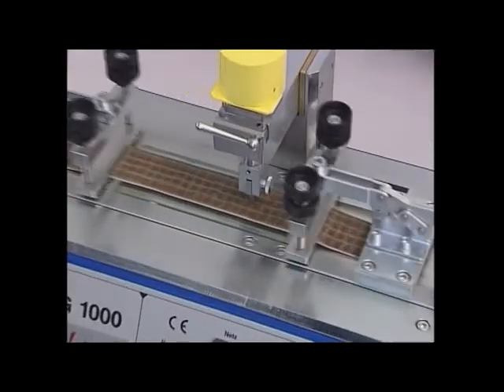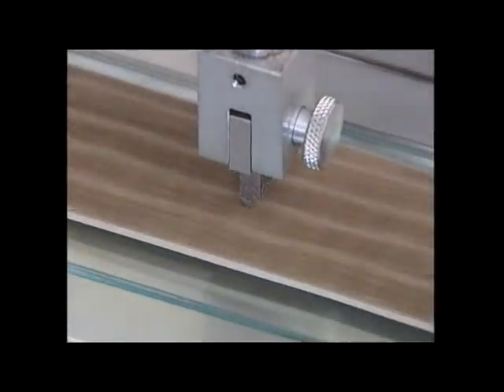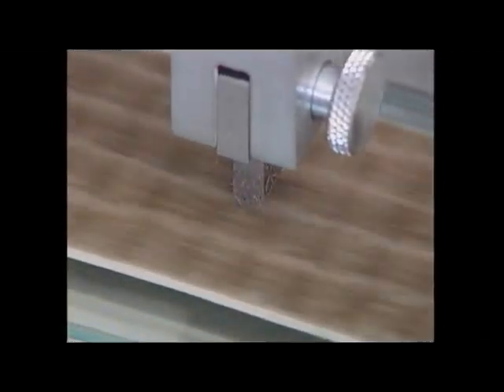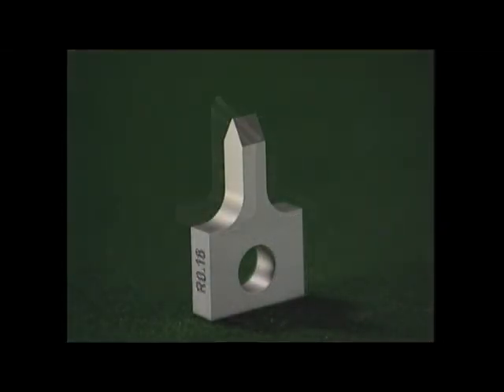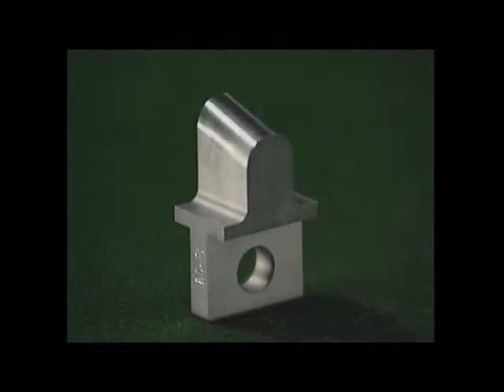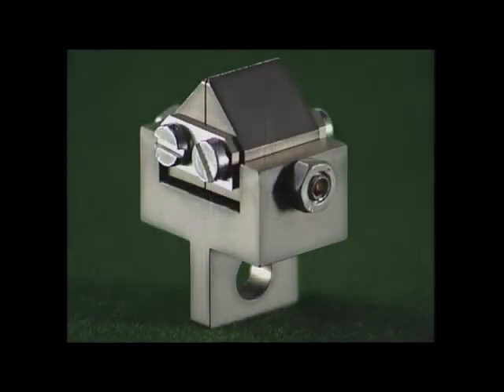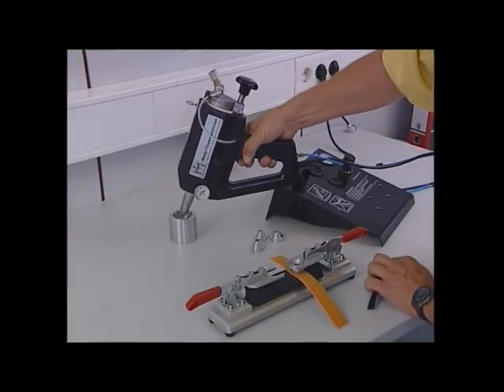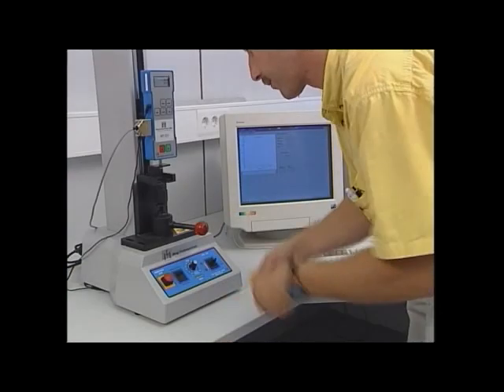One of the main characteristics for the quality of the finished Flock products is the abrasion resistance. Depending on the final use, different test blades with different weights test the abrasion resistance very thoroughly. Apart from the standard blade, based on the requirements of many car manufacturers, special blades are often also used for different applications.